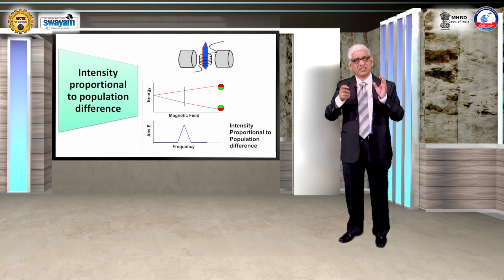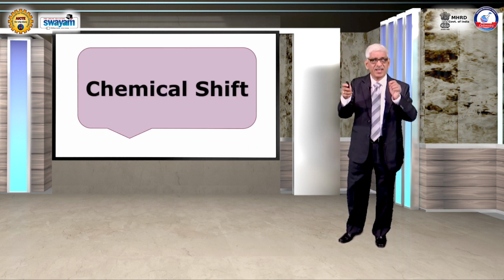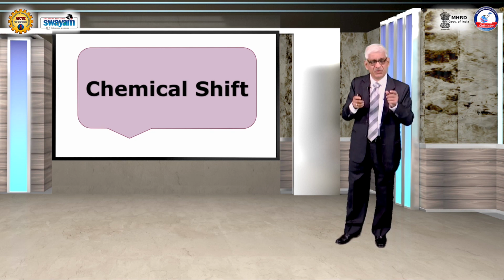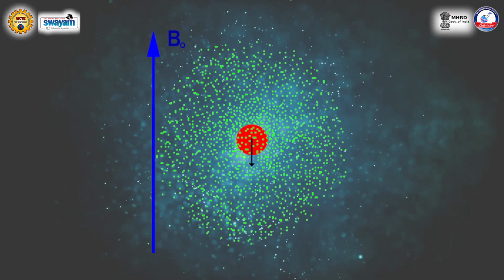Now let us look at some of the very basic discoveries in this context. One thing is the chemical shift, which I already mentioned to you. What is this?